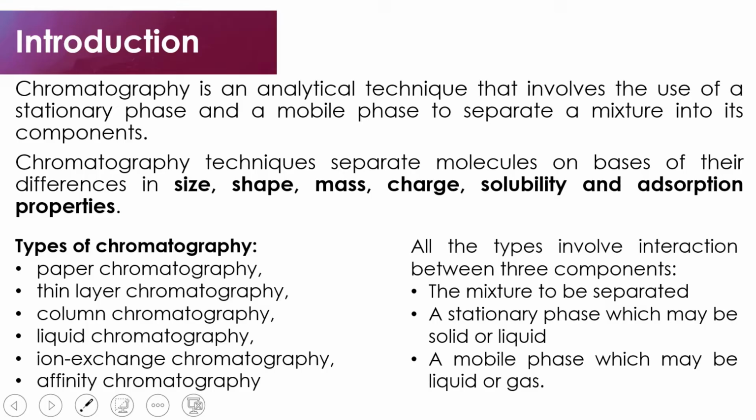And all these types of chromatography involve interaction between three components. 1. The mixture to be separated. 2. The stationary phase, which may either be a solid or a liquid. And 3. The mobile phase, which may either be a liquid or gas.